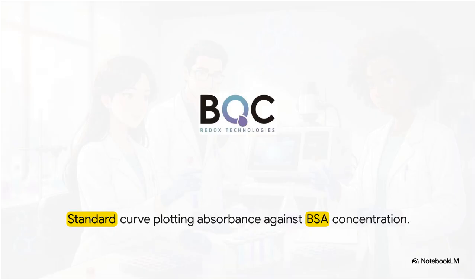To solve this, we rely on a spectrophotometer. This is a machine that shines a specific wavelength of light right through the liquid and measures exactly how much of that light gets absorbed. Basically, the darker the blue, the higher the absorbance. We then take the absorbance values of our known BSA standards and plot them on the y-axis against their known concentrations on the x-axis. This gives us our trend line.